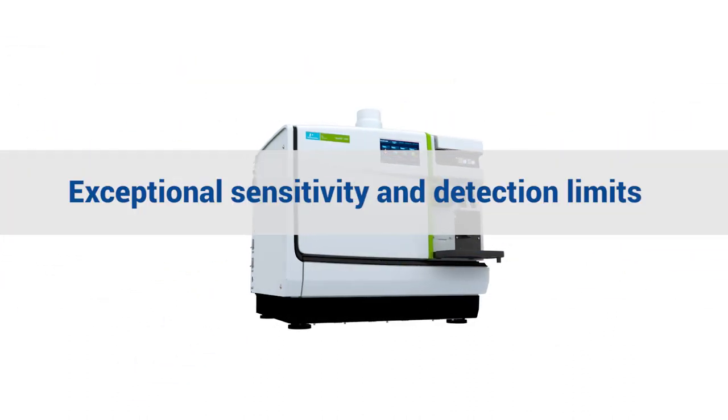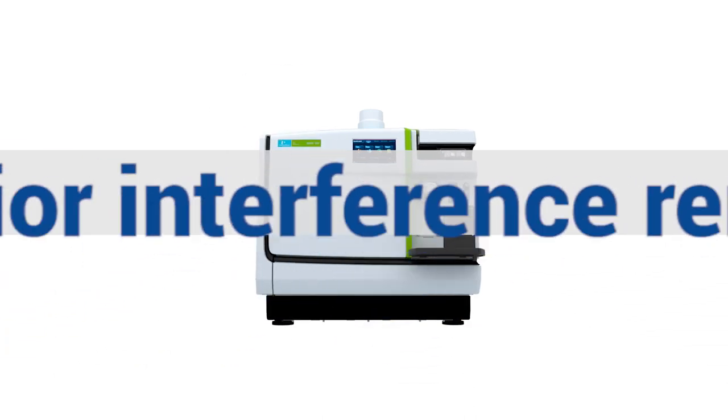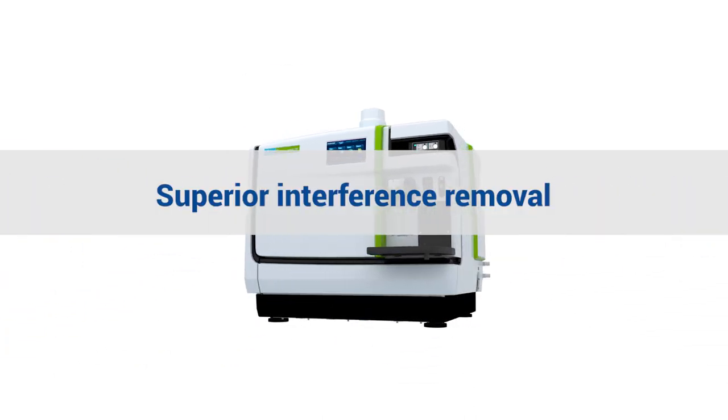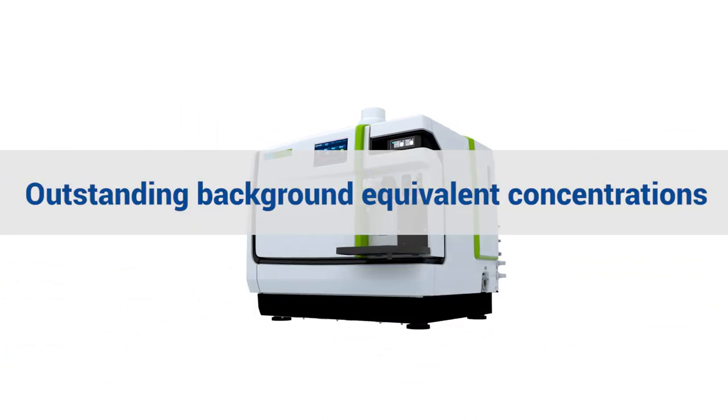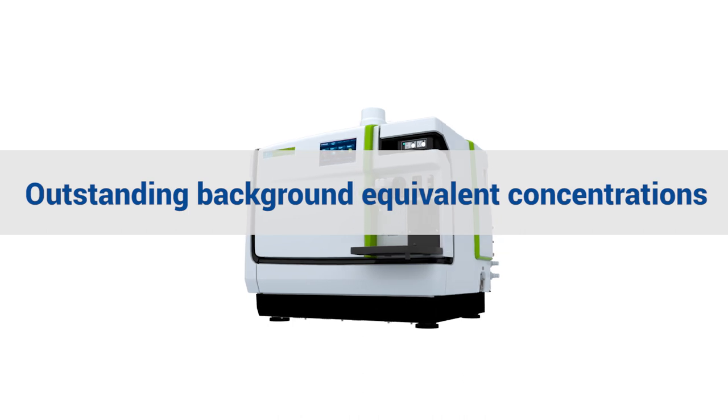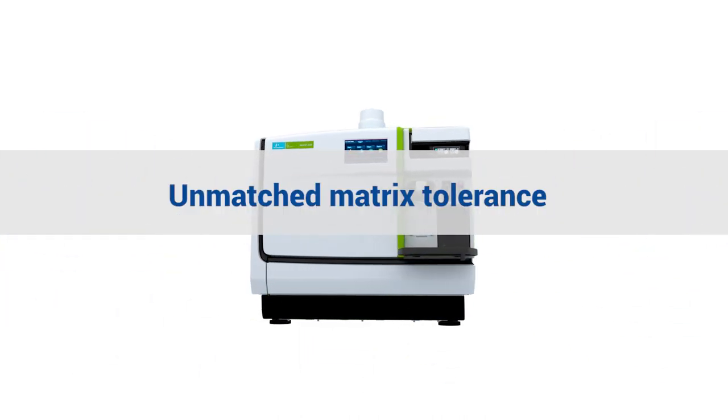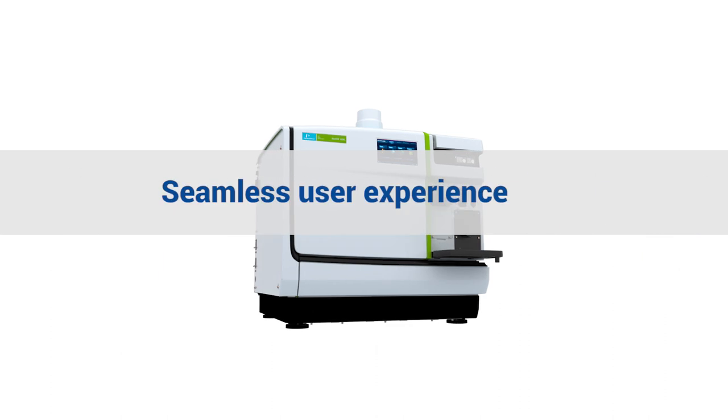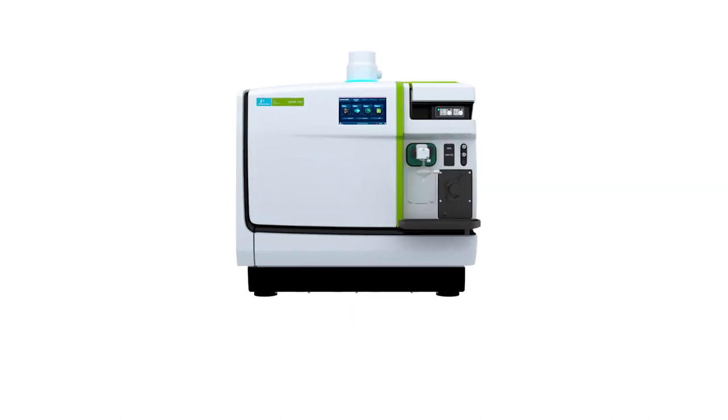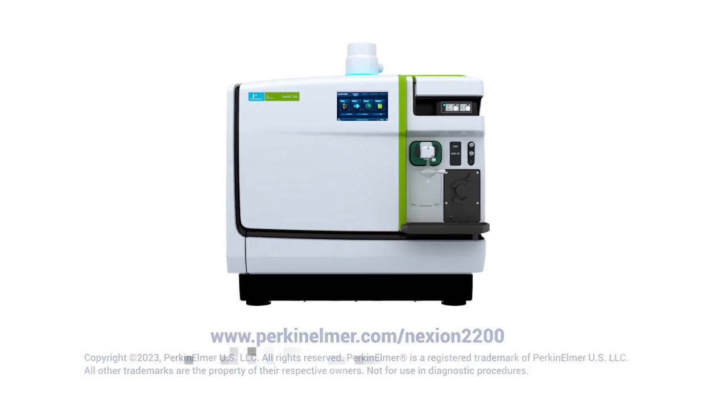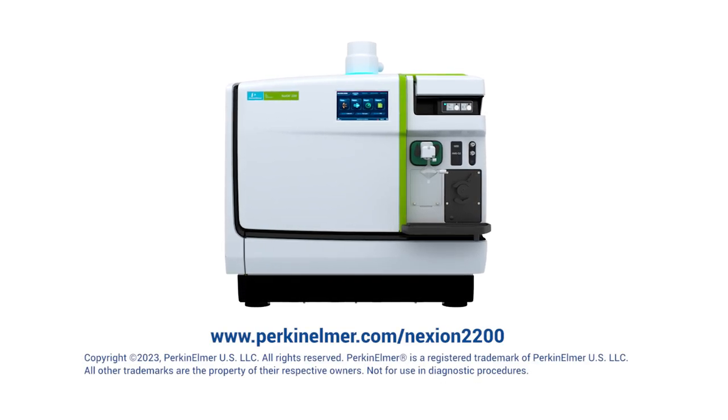Exceptional sensitivity and detection limits. Superior interference removal. Outstanding background equivalent concentrations. Unmatched matrix tolerance. Seamless user experience. The NexION 2200 ICP-MS from PerkinElmer, where uncompromised performance and uptime come together.